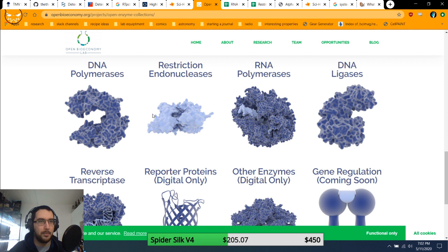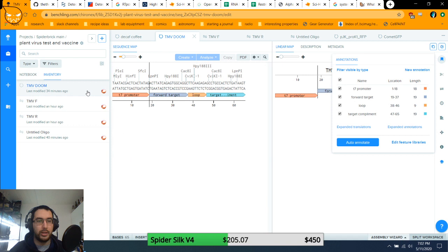And for that, I would take all the yeast out of my incubator, which I normally keep at 30 degrees. That way I can crank it up to 37, so the bacteria would grow very fast. So I could grow a shitload of the bacteria really quickly, lyse them. So I've got solution A. This stuff will arrive in 2 days. So I've got my solution B, making the RNA extract and then digesting it and then doing the protease and whatever.